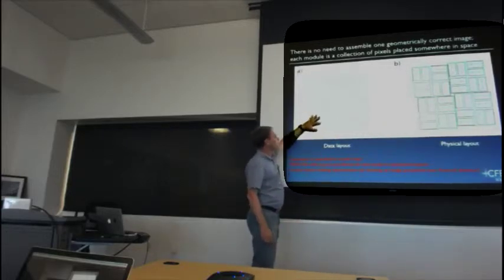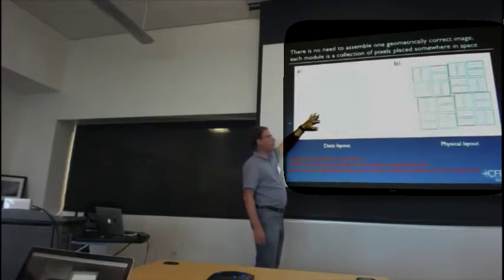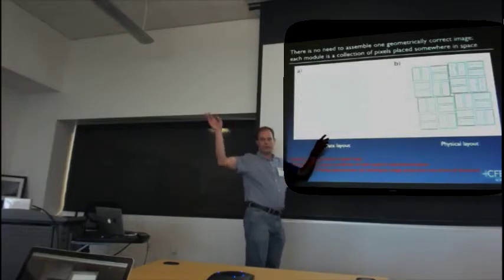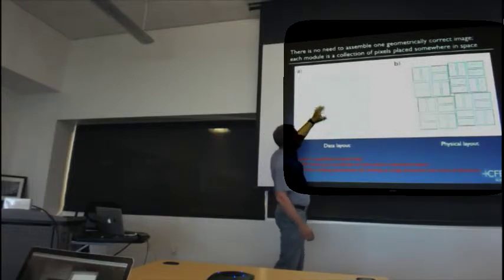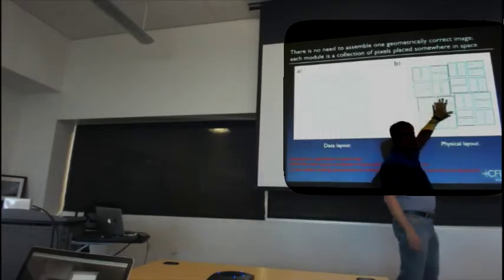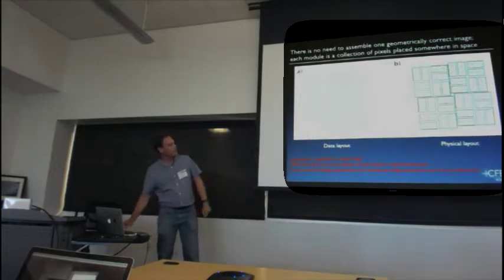All you care about is where the peak locations are on each sensor module. And then if you know the geometric specification of these, you can remap those pixels to wherever they're meant to be. And you also don't want to do interpolation of the data, if possible, because that might screw up your peak values. So what in practice we do is do the peak finding and integration on this very low-level layout, not caring which way all of these are twisted around, and then apply the geometry just as a last step. Let me make that concrete.